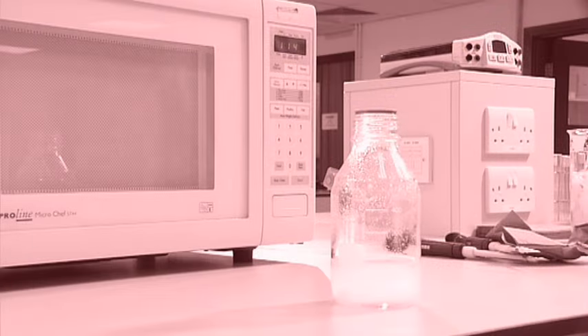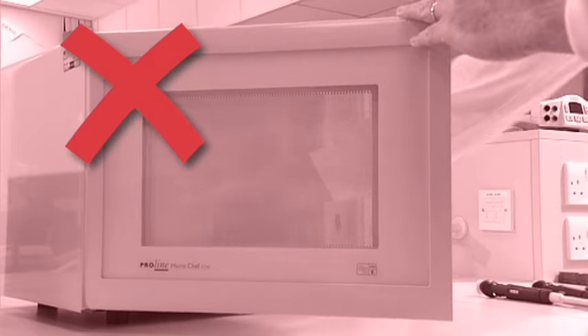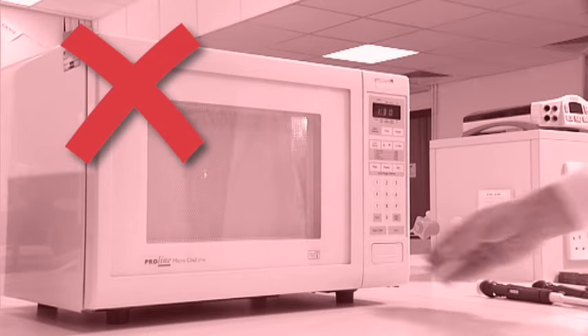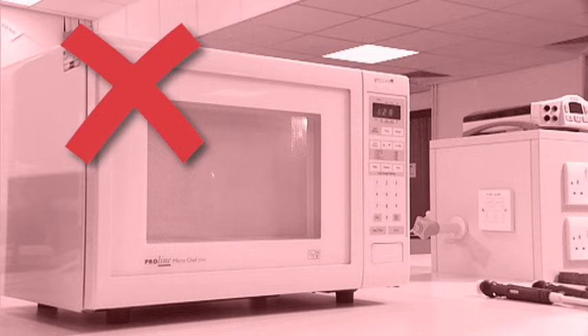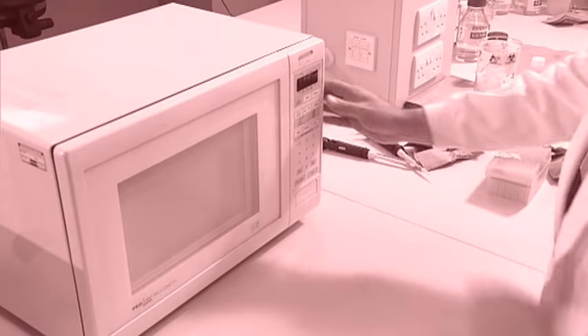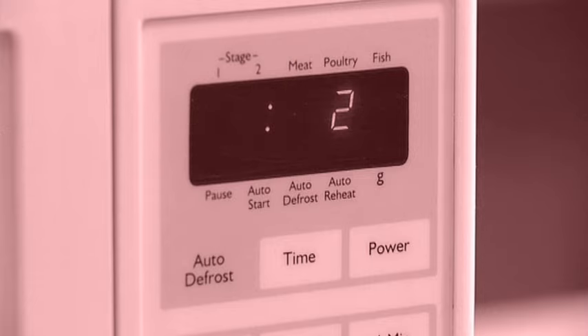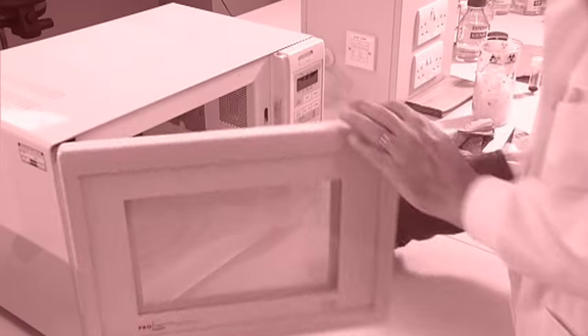When heating an agarose solution, it's important that a loose top is placed on the container. If the top is too tight, there can be dangerous pressure buildup within the container which can cause it to break. When making an agarose gel, don't leave the gel solution unattended while it's heating in the microwave oven. A solution heated for too long will lose water, increasing the agarose concentration of the final gel or even burning the gel mixture.